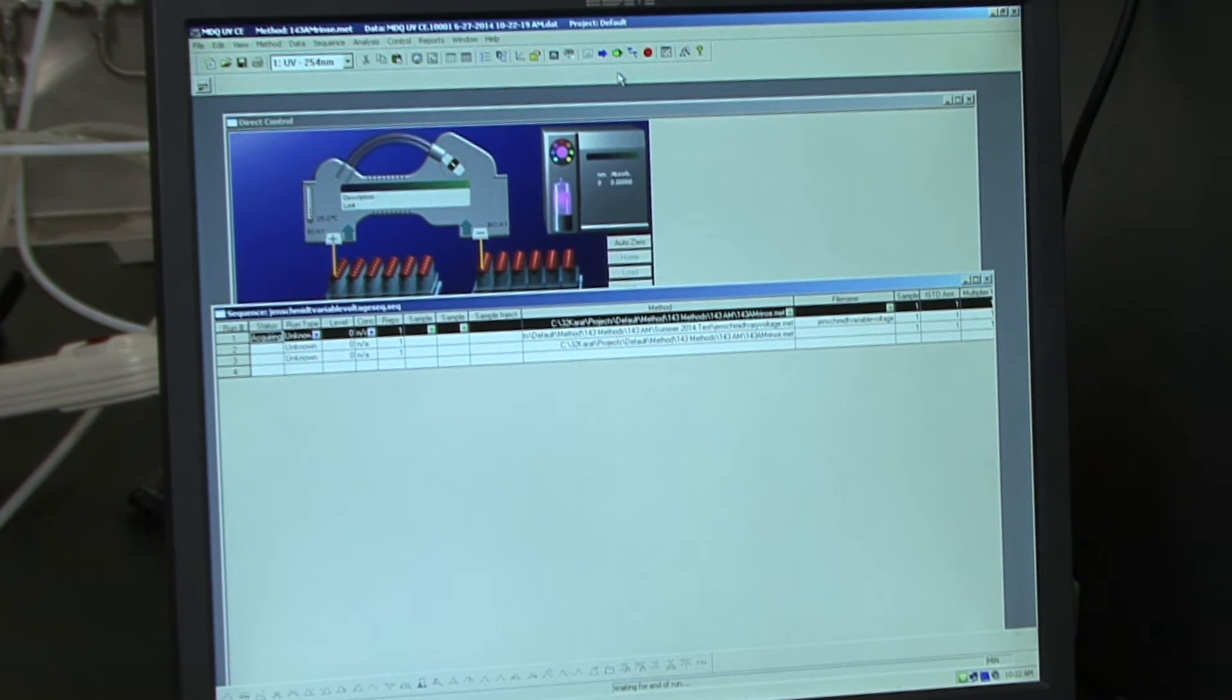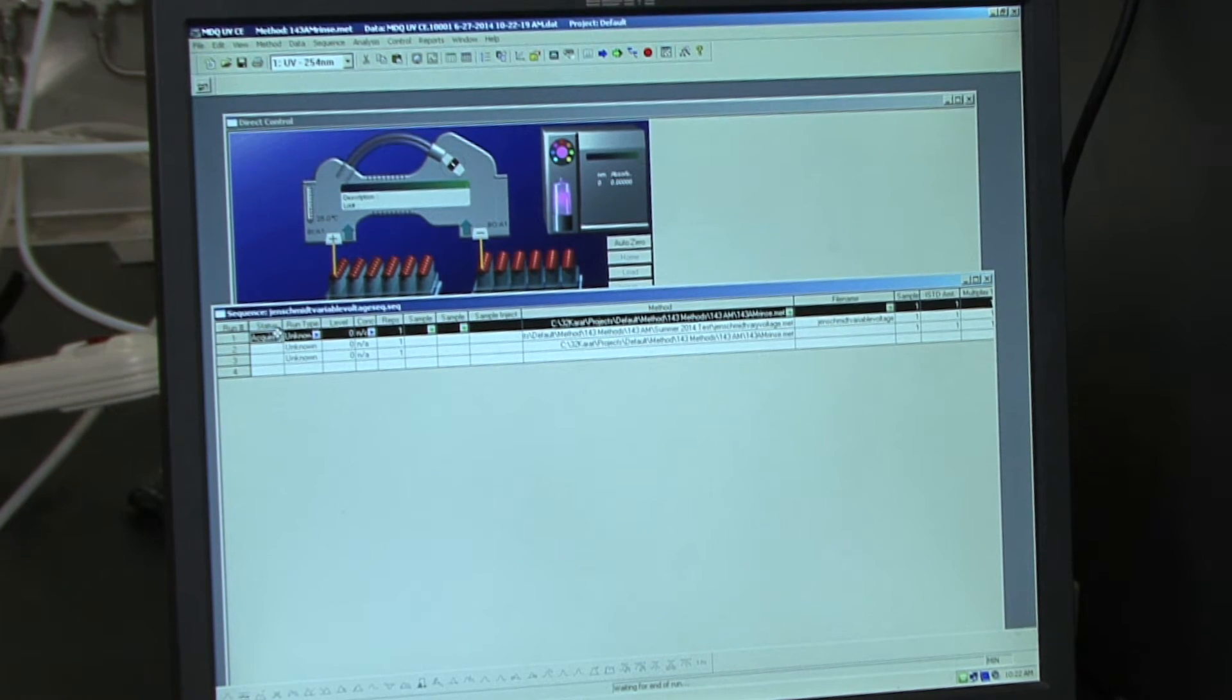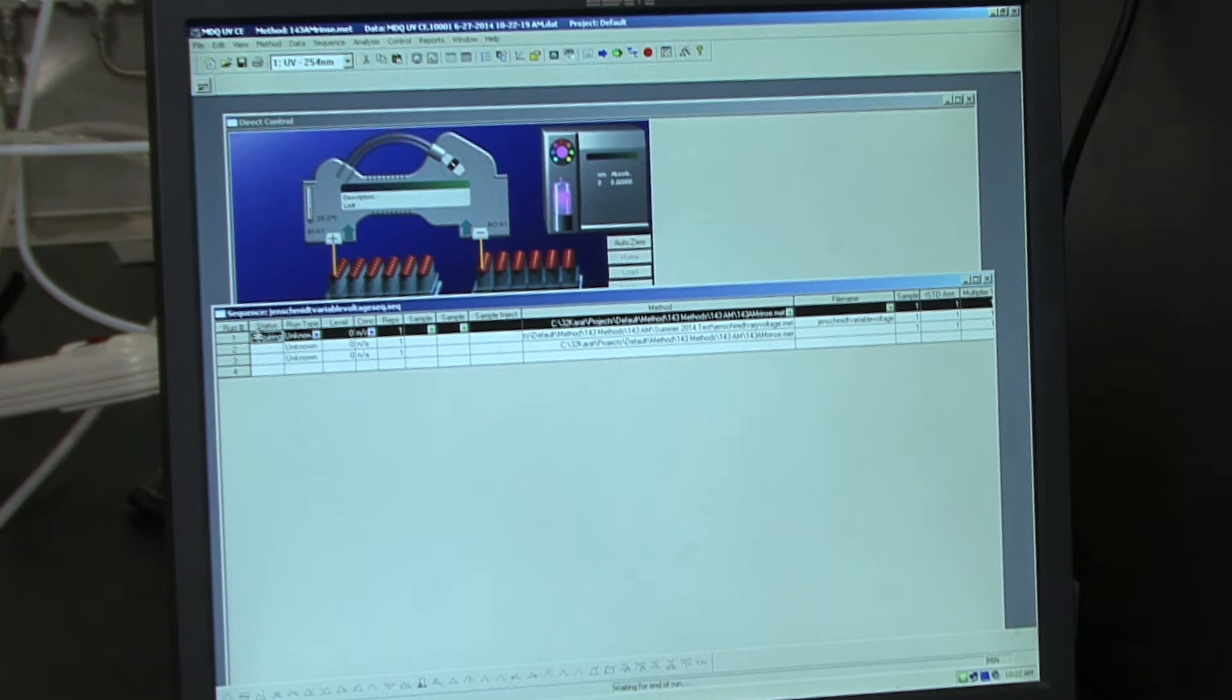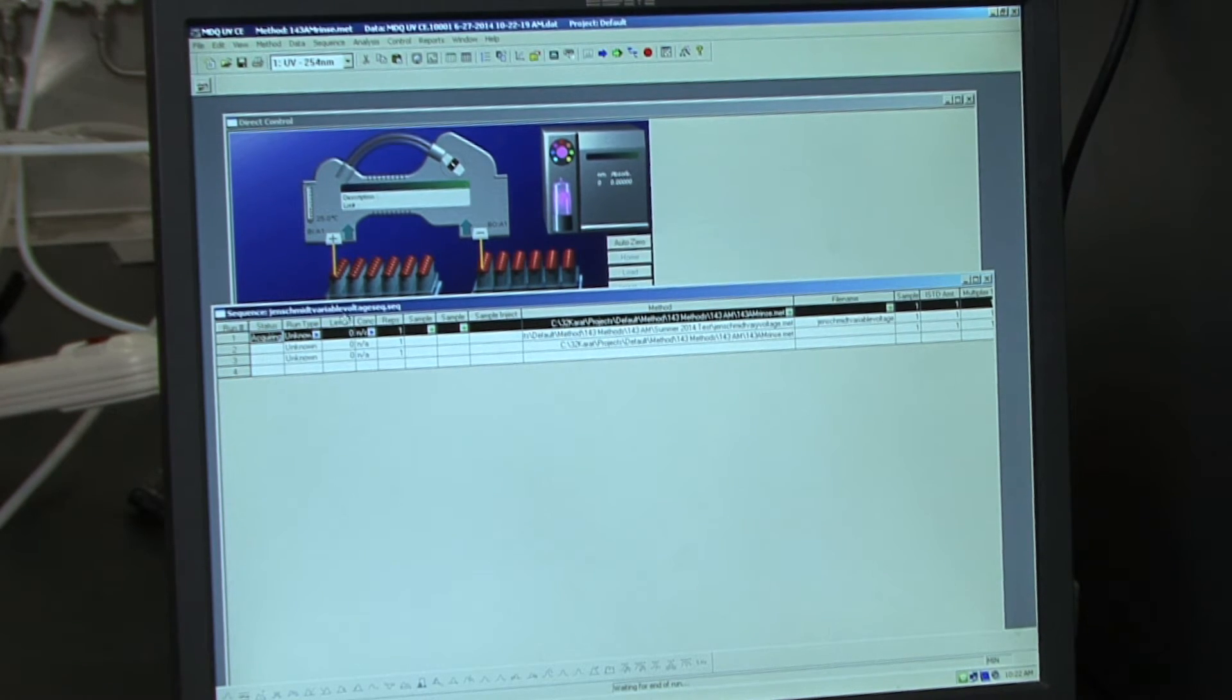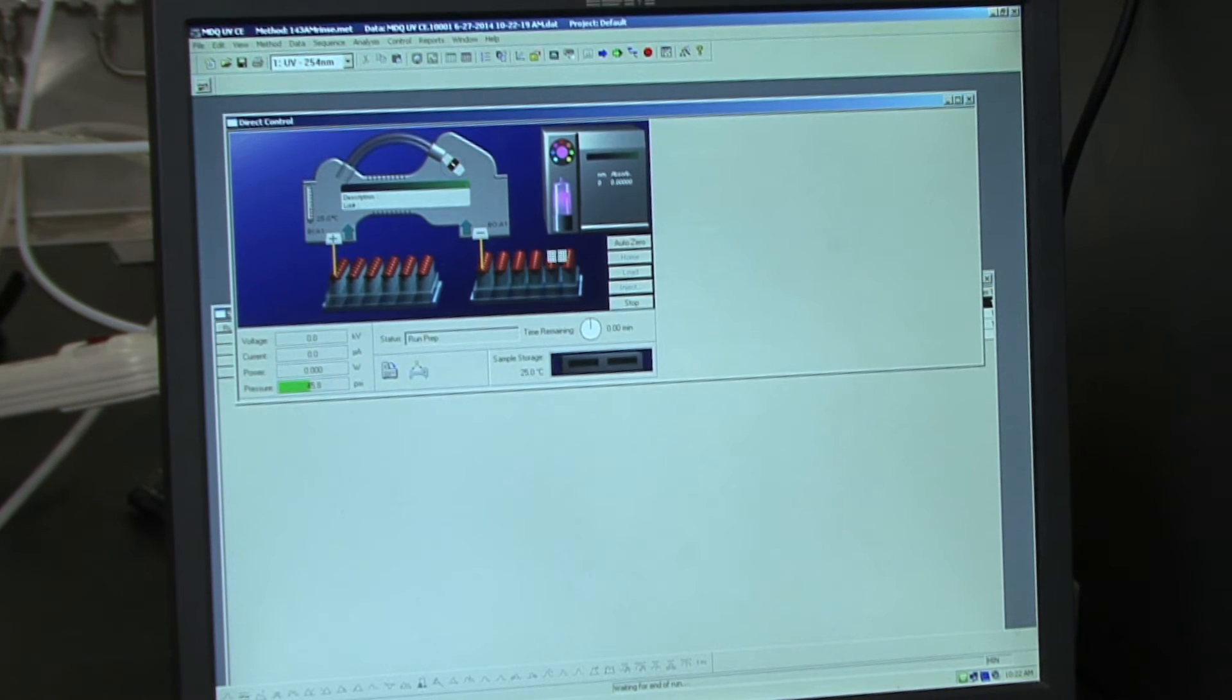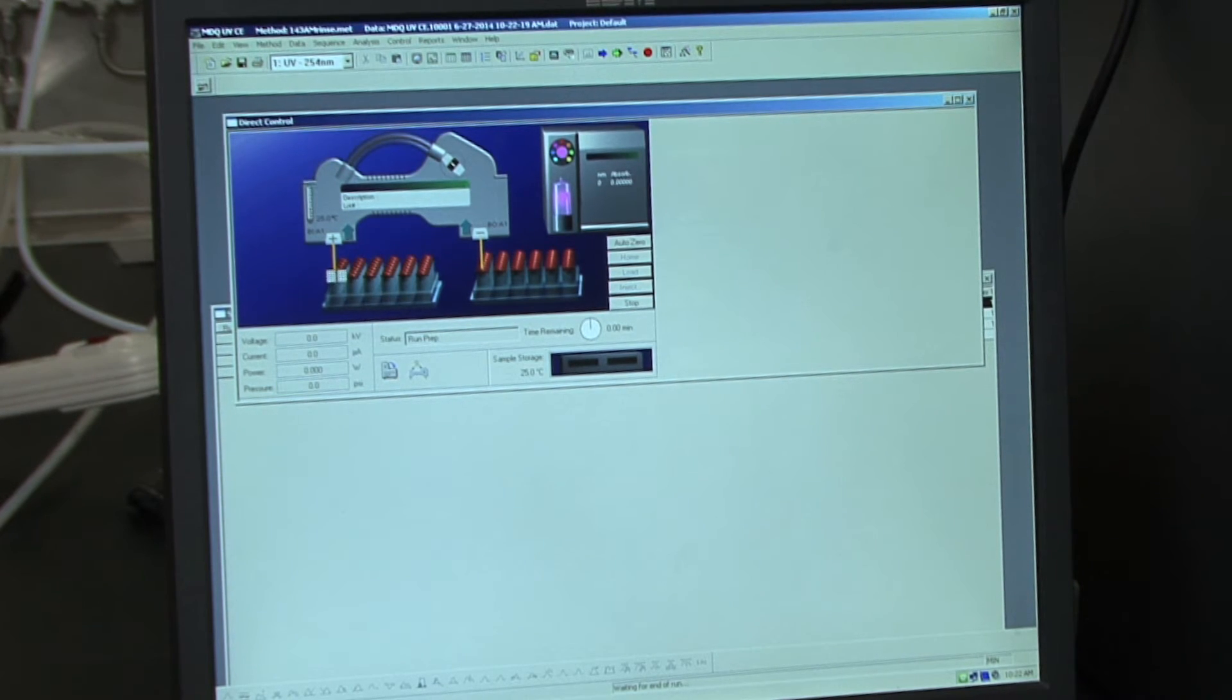So as the CE is collecting data, you can watch the status of your sequence. So here it is now injecting the rinse vial and the status here says Acquiring. You can also watch the animation in the direct control window here to follow along which sample the instrument is injecting.